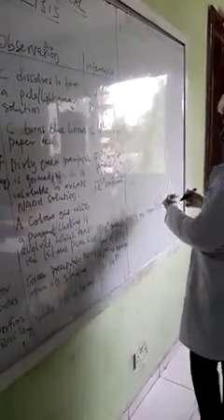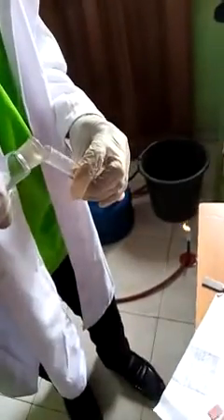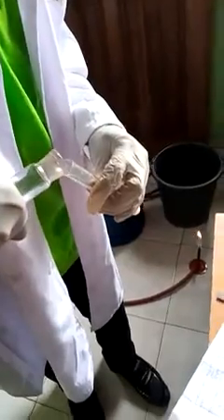So now let's add dilute HCl, followed by excess dilute HCl. So what can you observe? See, the white precipitate did not dissolve. So you say white precipitate insoluble, or does not dissolve, in excess dilute HCl. So what does that mean? Which reagent or salt gives us that result?